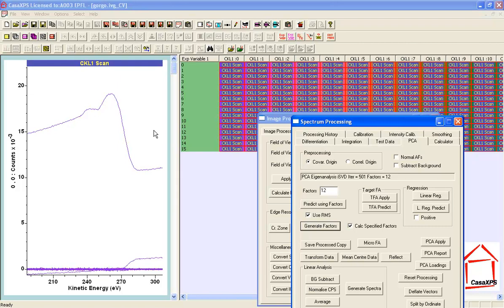So now we have the abstract factors in the process form of the data for each one of these VAMAS blocks. Only the first 12 have genuine abstract factors. The other VAMAS blocks all contain a partial calculation of the singular value decomposition that would be required to generate all of the abstract factors by only calculating 12 abstract factors.